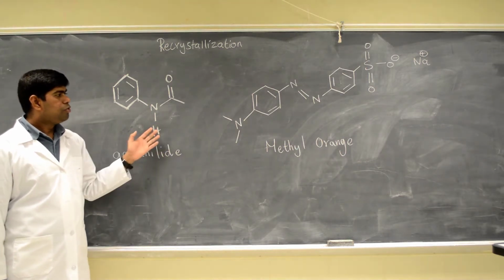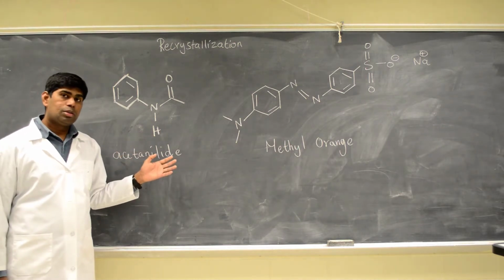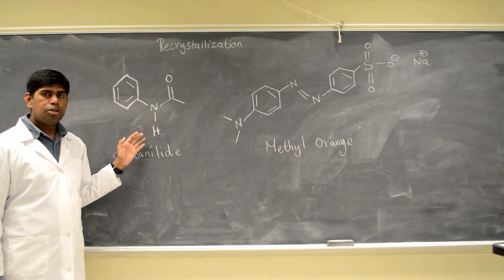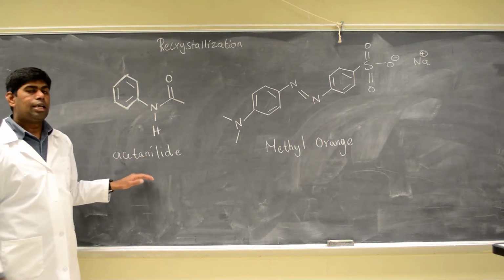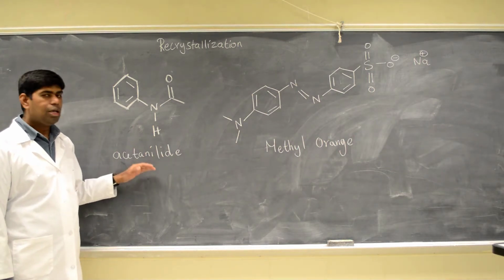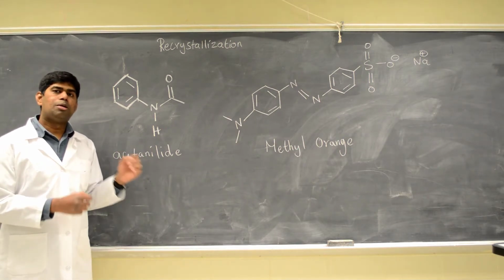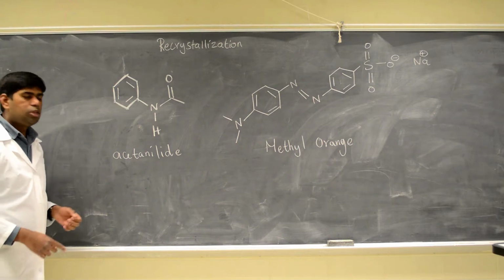We mix these two solids and use water to separate them. They have different solubility in water. Acetanilide is selectively soluble at a higher temperature. The solubility of acetanilide in water depends on temperature. At a higher temperature, acetanilide is soluble in water.